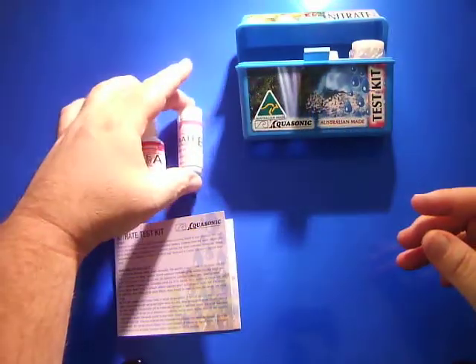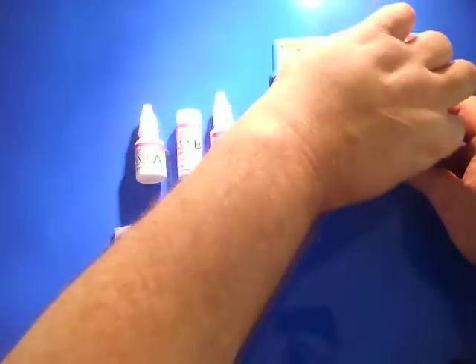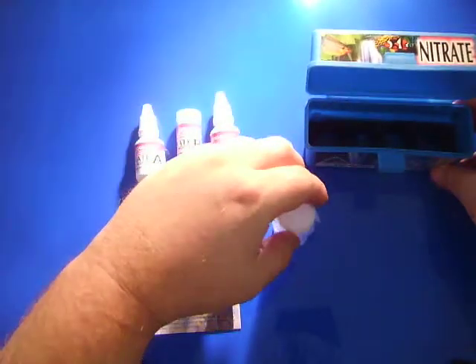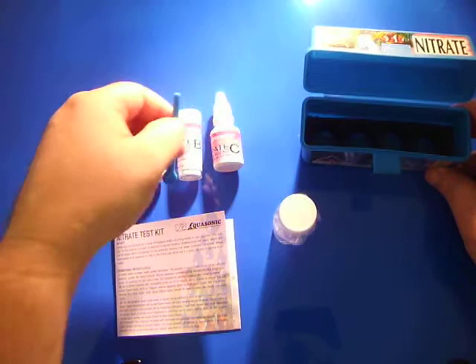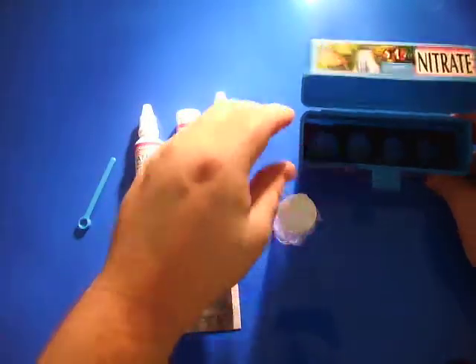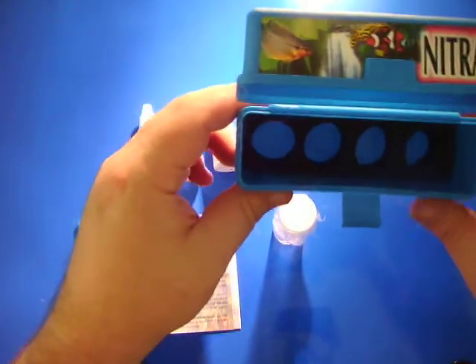It comes with reagent A, reagent B which is a powder form, reagent C, the test tube, and a little spoon for the powder reagent B. It has a foam insert so it keeps everything nice and neat, in the position it needs to be, and keeps the water away.